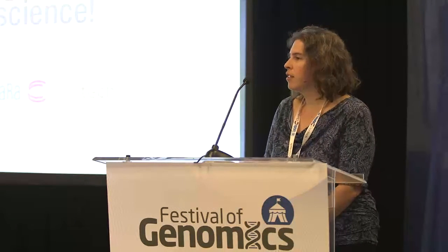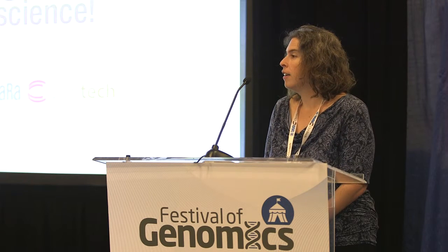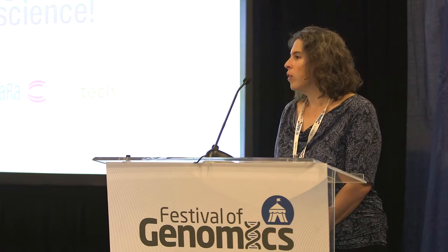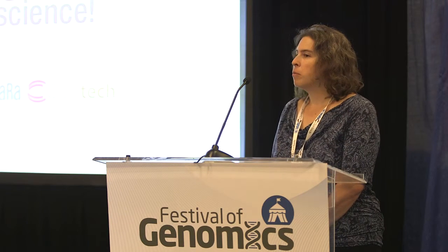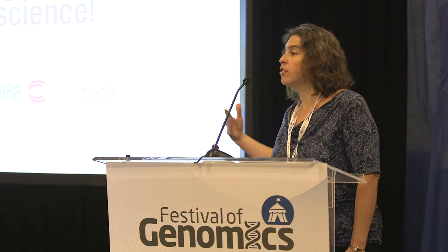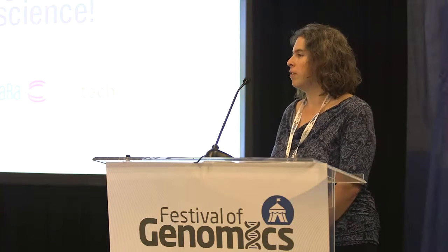We're starting to use other platforms, like TopHat and other freeware, so that it's more similar to what our customers would use. So we are moving towards that. We actually don't use any special tools right now, but we're trying to learn more about what customers are doing and what kind of tools we might be able to use and to show data from that. But this is really just very simple analysis.